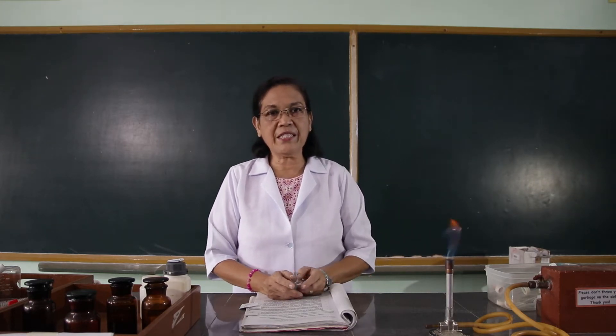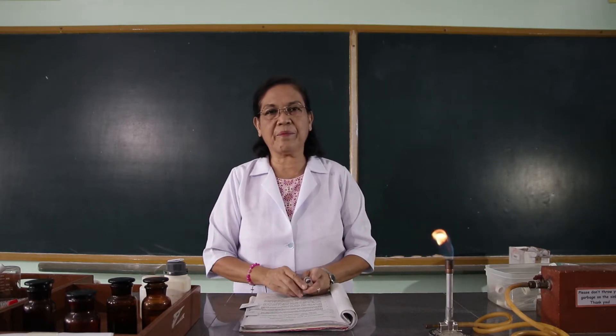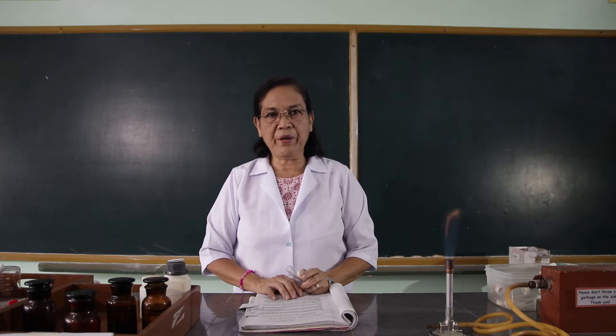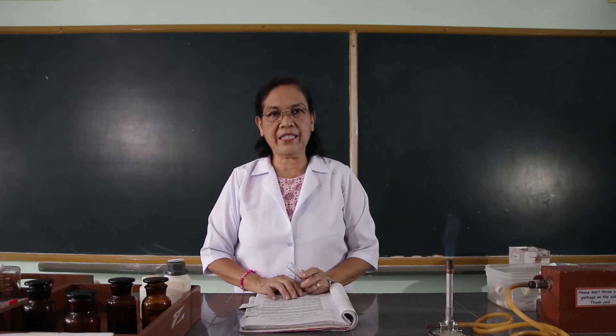So today we are going to perform this second experiment for organic chemistry. For the first part of this experiment, we are going to heat a small amount of egg albumin in a test tube. I would like you to observe what happens to the egg albumin when it is heated.